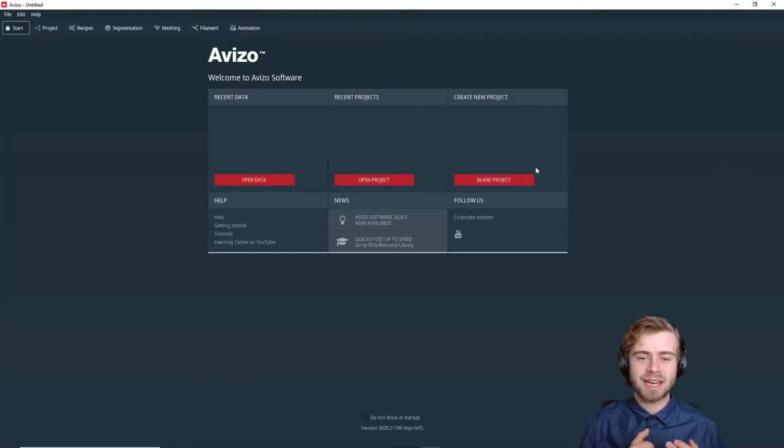Hi, my name is Sam, and today we're going to go over label fields and how to use dedicated color maps. So to start out, let's open some data.